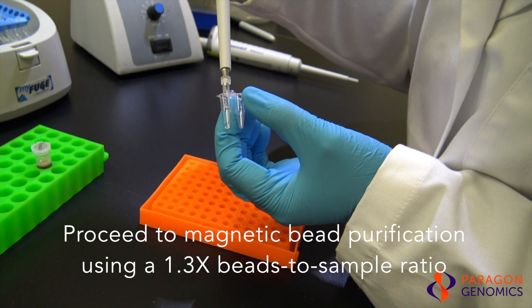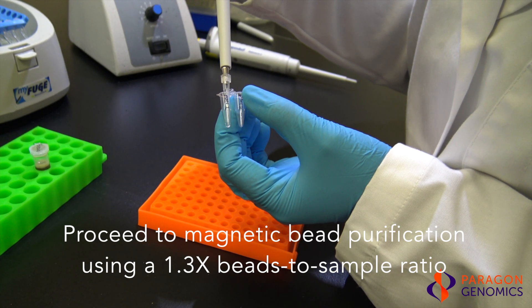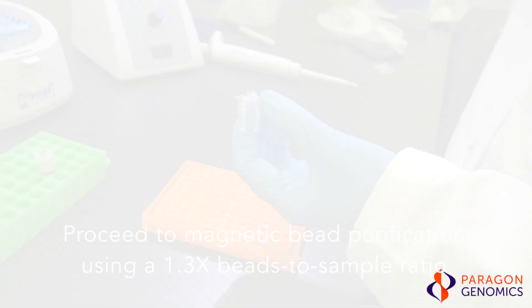The samples are now ready to be purified using CleanMag magnetic beads using a 1.3 times beads to sample ratio.